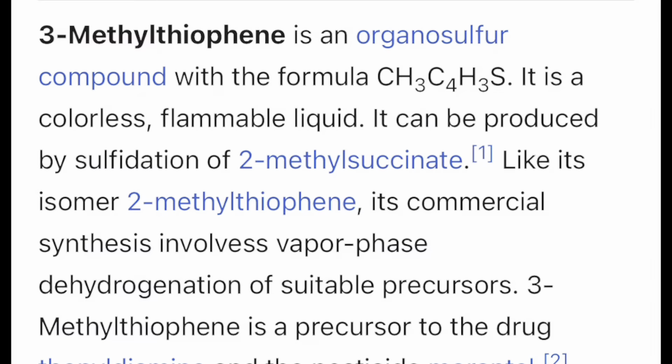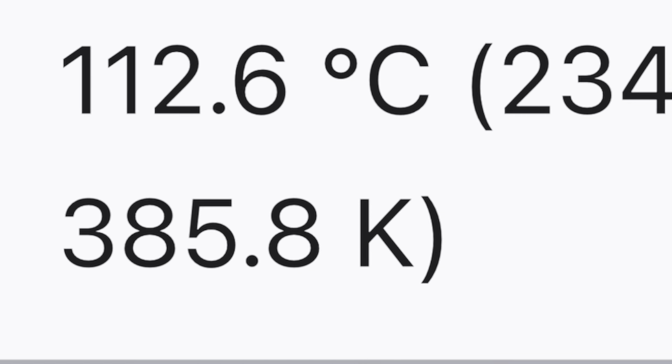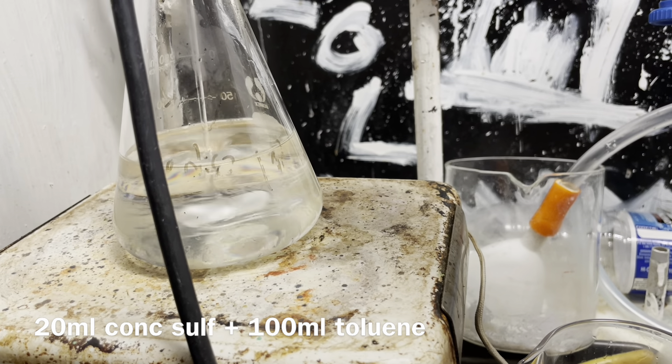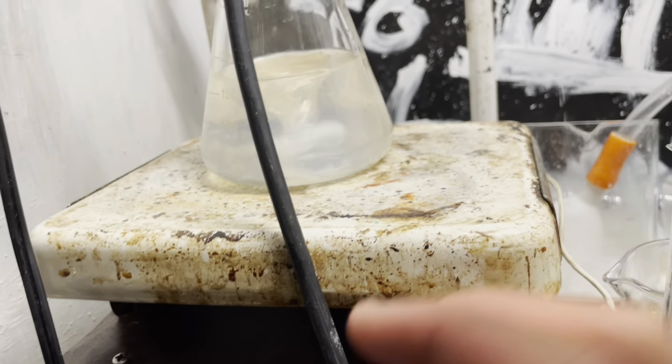The first step is to remove the methylthiophene impurity from toluene, because I bought technical-grade toluene. This impurity is present because it's present in petroleum, and toluene is distilled from petroleum, and they have very close boiling points. To our 100 milliliters of toluene, we're going to add 20 milliliters of concentrated sulfuric acid and give it very strong stirring.